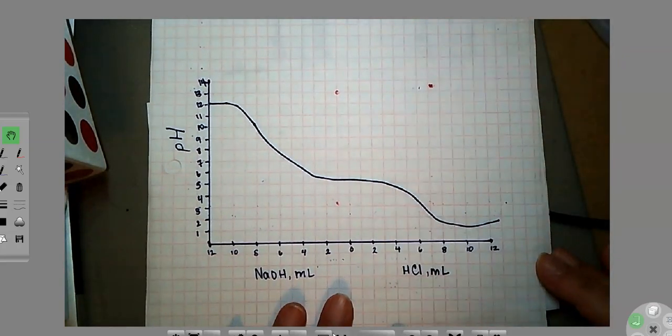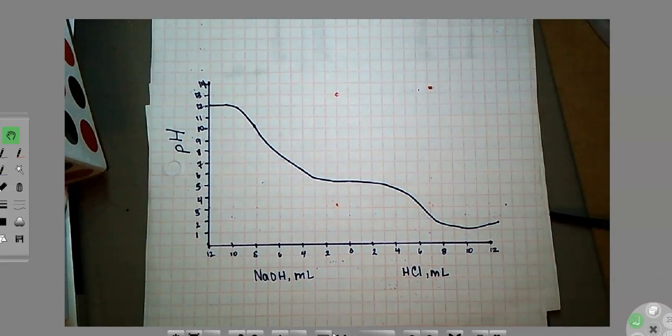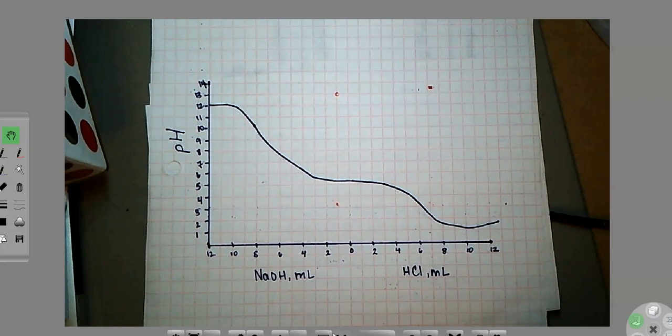I want you to determine the buffering capacity, which is going to be in mLs, and I want you to determine the pH range as well. So go ahead and pause that, please.